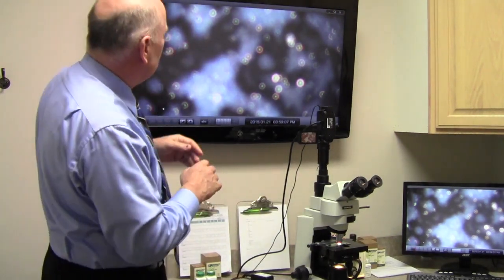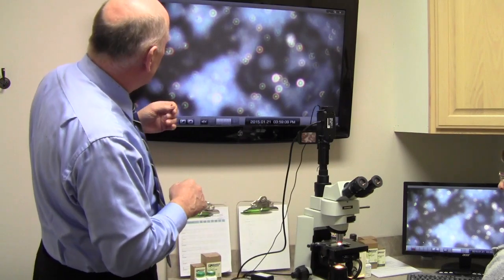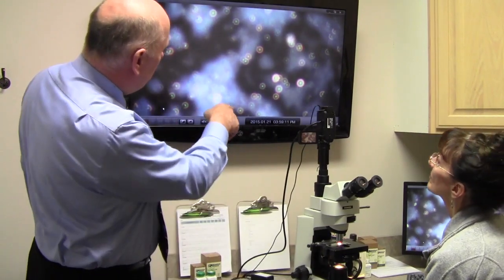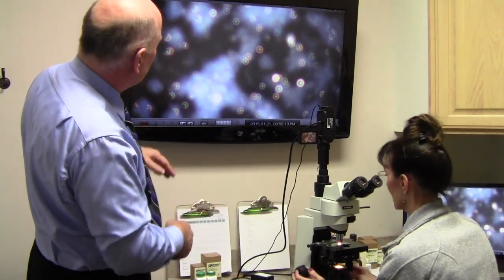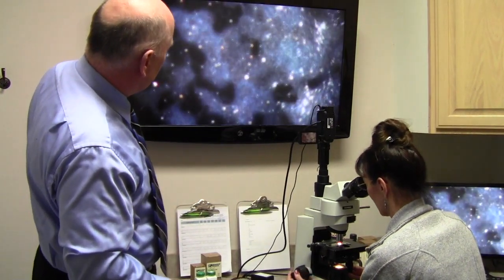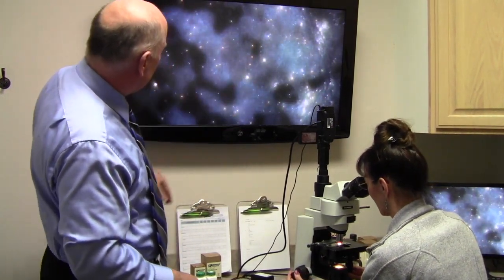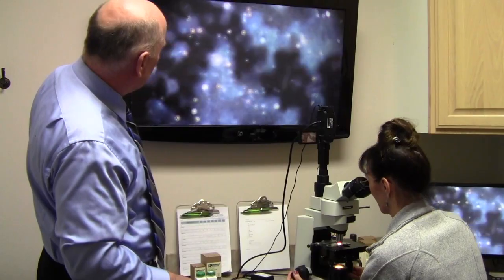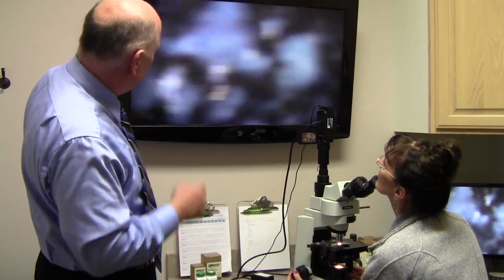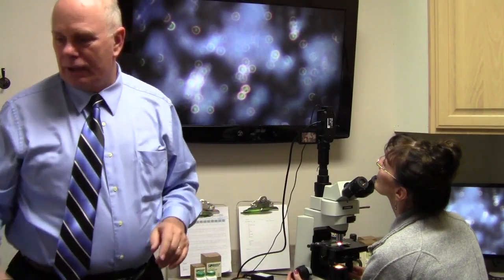And so we're going to do a couple of fun experiments here today with this. So just slide over, move over places, we can see that it's all over the place, all those particles. Yeah, just pretty well uniform on that. Then we're going to do something else here.